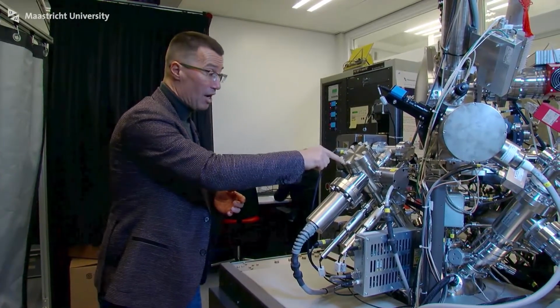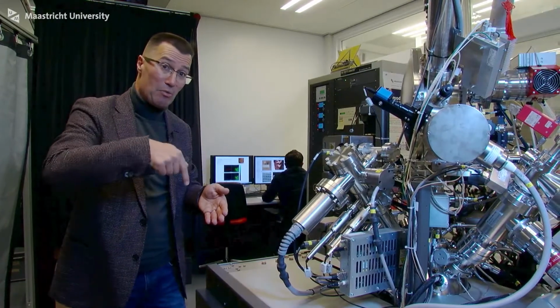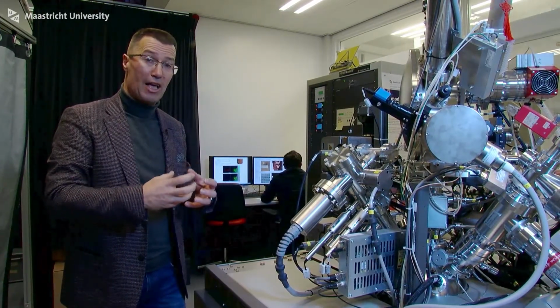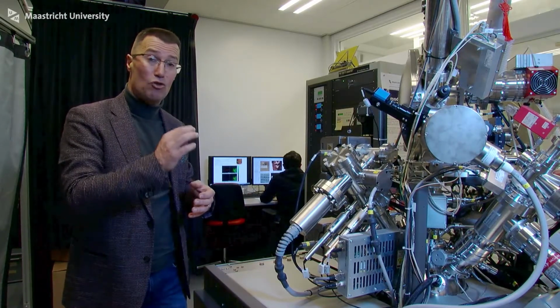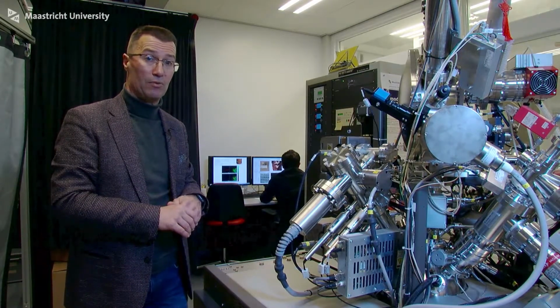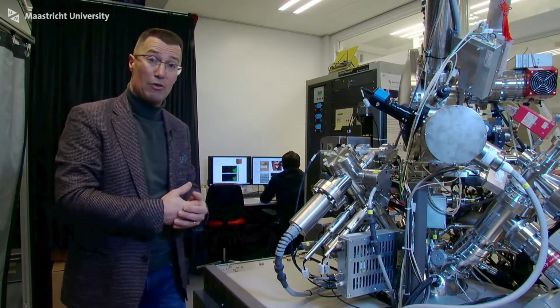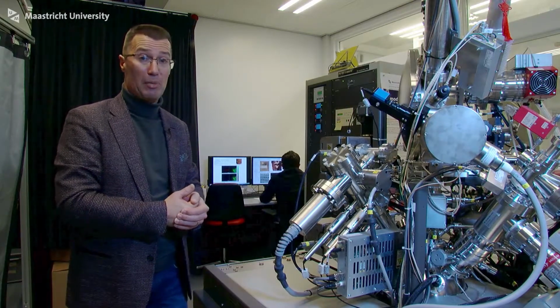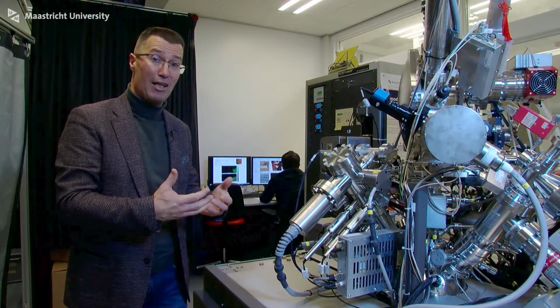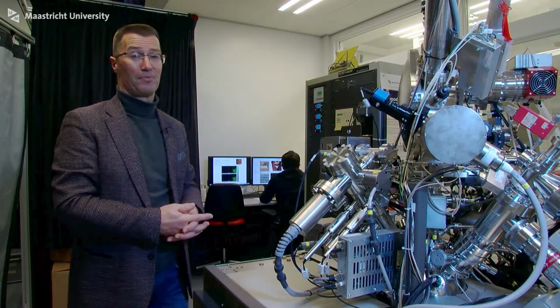We focus these ion beams down to the paint cross-section, scan every little nanometer on the surface, and understand the chemical complexity of the binding medium, the pigment particles, into great elemental and molecular detail. And that information helps us to understand whether or not the pigments that are in these paint cross-sections are real to the era where the painting is supposedly painted. So it helps us to understand the molecular aspects of aging of this complex work of painted art.